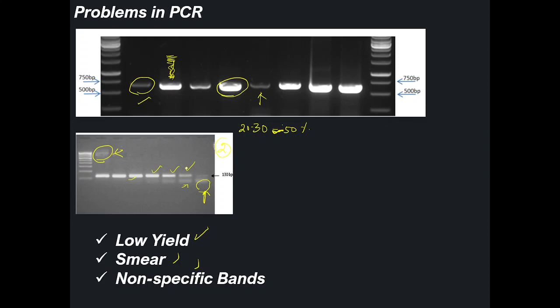Now, having said this, I will try to focus here on only one of the problems of PCR, that is no PCR band, because that is the major problem, if someone is not having a PCR amplification.